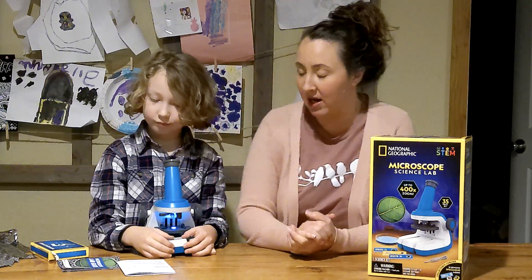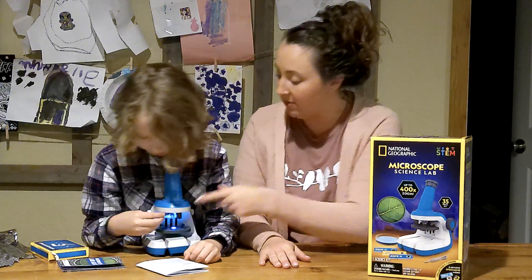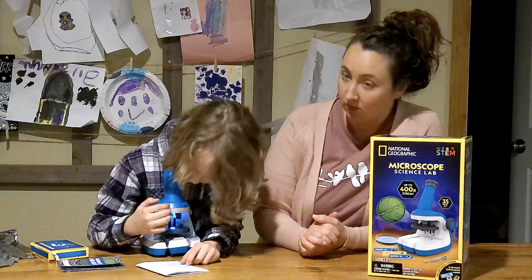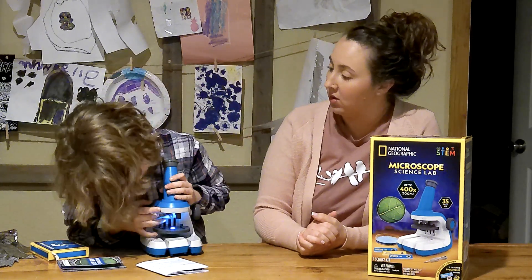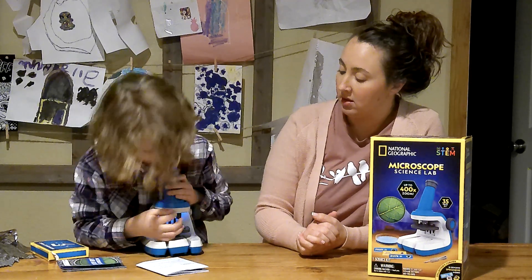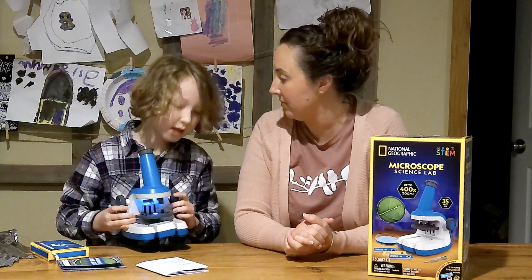So can you tell us some things about the microscope? How about the different magnification levels? There's 40, there's 100, and there's 400. Under the 400 one you can see lots, right? Yeah.